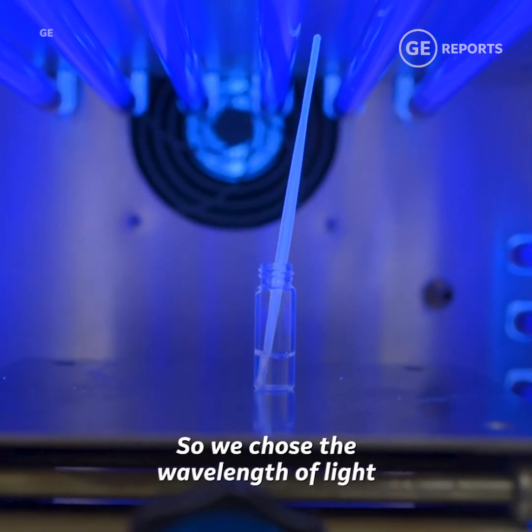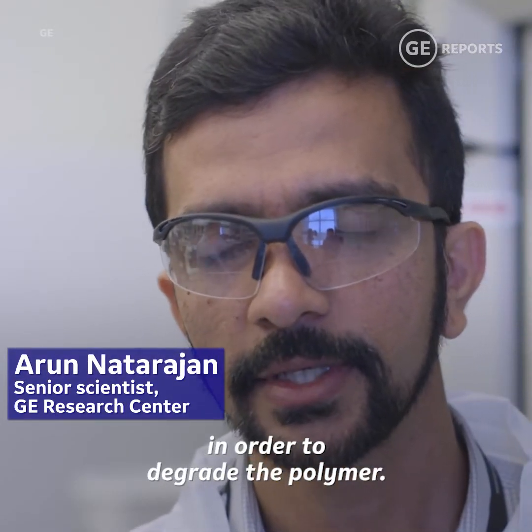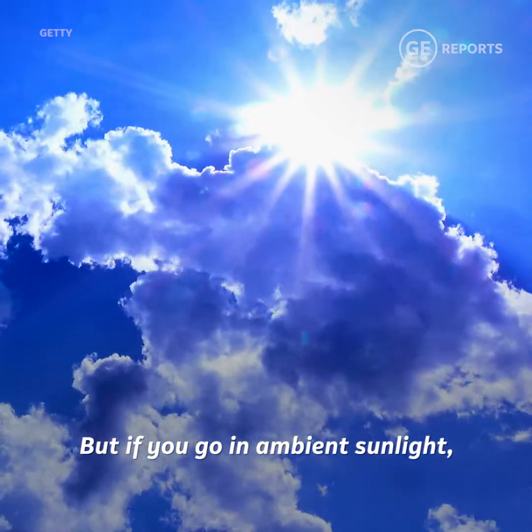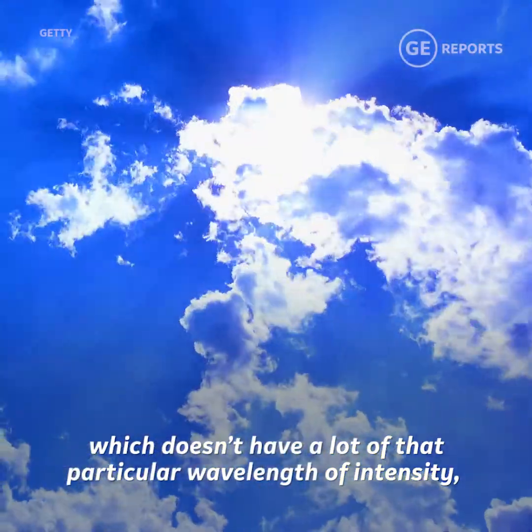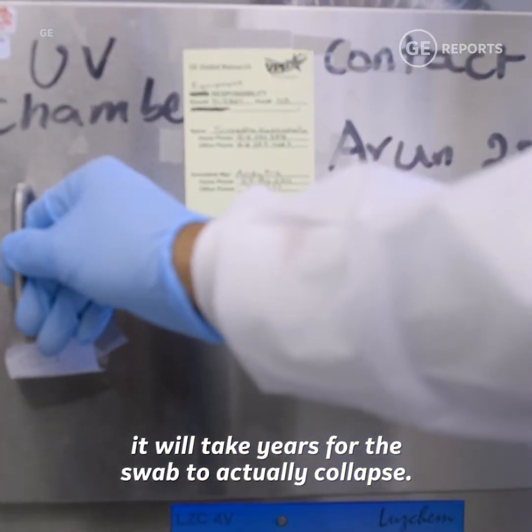We chose the wavelength of light with the higher intensity to hit the sample in order to degrade the polymer. But if you go in ambient sunlight, which doesn't have a lot of that particular wavelength of intensity — which is in the UV range — it will take years for the swab to actually collapse.